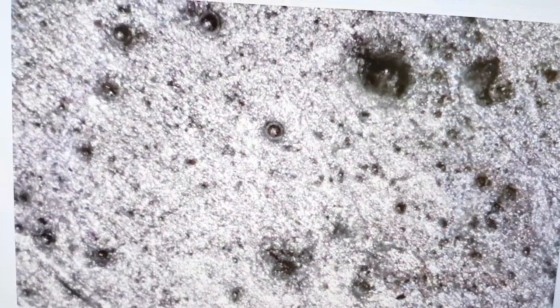You can see the structure of these very well by looking at this. That's with all the lights on. You can really see they are spheres kind of embedded into this mostly nickel surface.